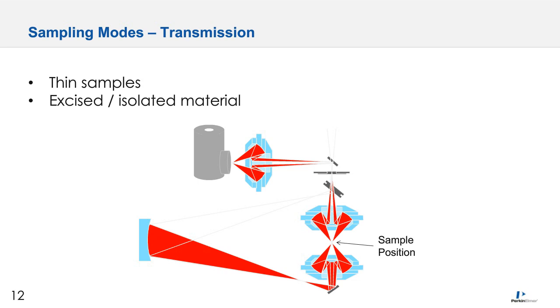Now, once it is isolated from the substrate or from the product, then it can be transferred to an infrared transmissive disk, such as a potassium bromide or KBr disk. In some instances, a microtome is sometimes employed to prepare a thin section of the sample for transmission measurement as well. Microtomes allow users to cut samples to a tightly controlled thickness.